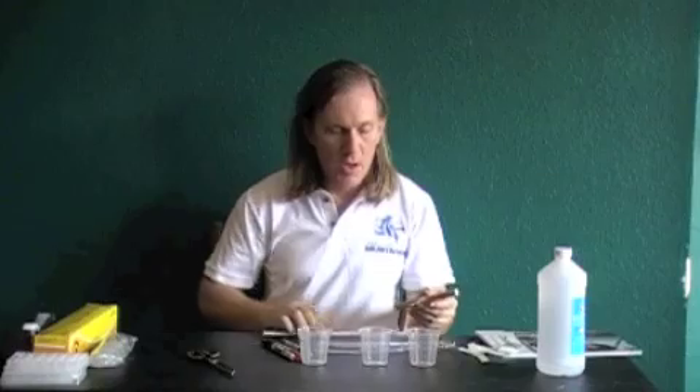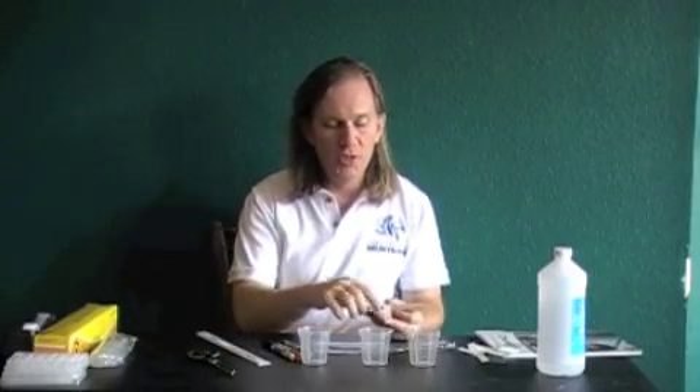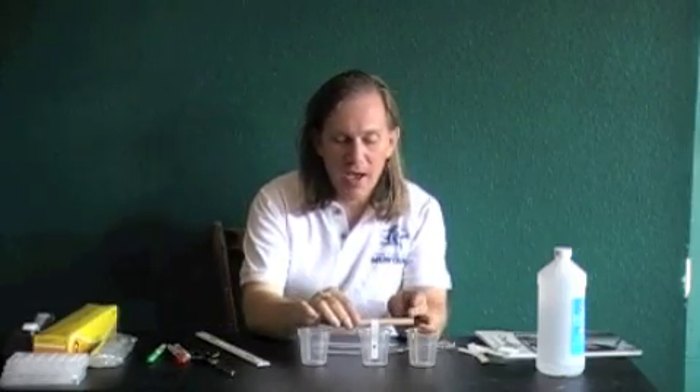Take your ruler, measure about two centimeters up your paper, and at that point put a black dot. The instructions say a half millimeter black dot — it's just kind of a large black dot. For the purpose of this video, I'm just going to be doing the black, not the red and green, but when you're actually doing the experiment, you're going to do all three.